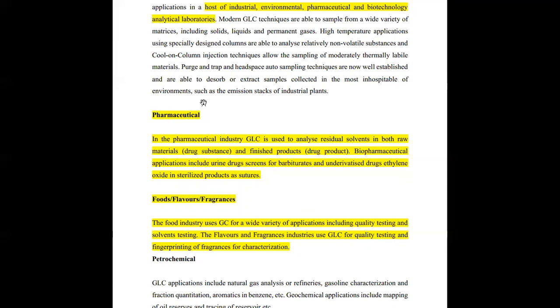We are able to tell the amount of components that are present in there, because we are avoiding a situation whereby someone makes Panadol and then includes stones, which are not important in the healing of the body. So you have to make sure that the things that are present in the drugs are those specifically meant for curing a specific illness.